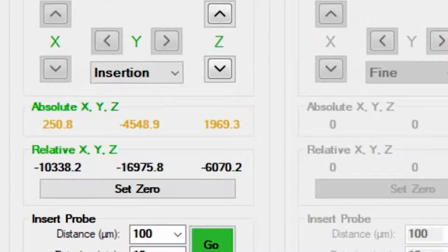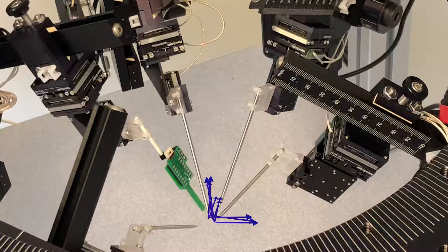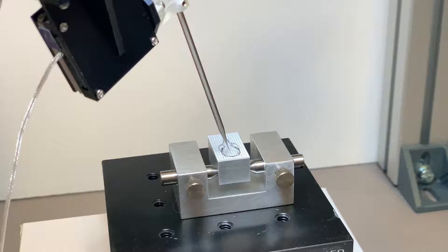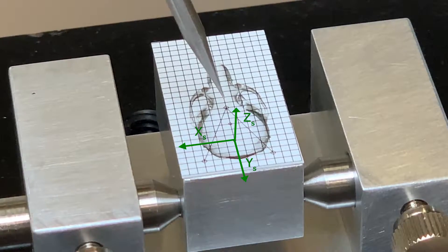In this mode, input commands will produce stereotactic X, Y, and Z motions. All probes in the system will move in the same stereotactic axes. Furthermore, the stereotactic axes conveniently coincide with the orientation of the brain within a standard holder.